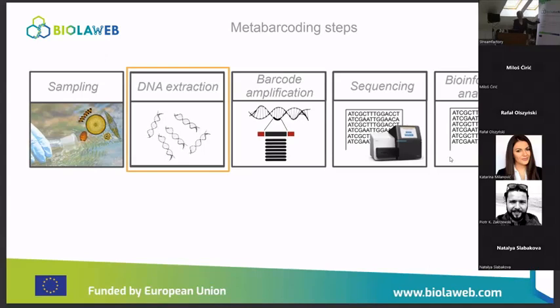It's not present in every sampling, because it can be quite heavy to always extract DNA from a negative control, but it's nice to verify sometimes that everything is working well. You have to think that the filters are very expensive. One of these Sterivex filters is maybe $16, so we have to be careful not to use too many. It can be used if you are regularly sampling, maybe every 3 months or every year, to be sure that everything is fine.